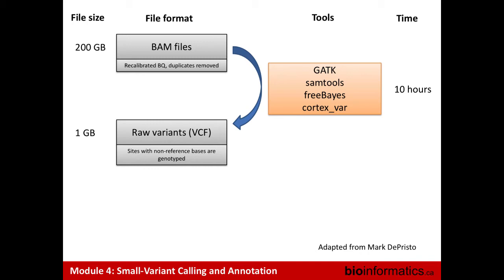Mostly we'll use GATK, which is one of the most performant callers, called HaplotypeCaller. But other callers exist, like SAMtools, FreeBayes, Cortex. And one of my main messages here: I'm talking about traditional DNA-seq. If you are doing cancer, forget about that. It's a completely different type of variant caller, because in cancer there are many other parameters to take into account, like purity, cellularity, clonality. So these callers are not dedicated to work with cancer. Here, it's really callers dedicated to traditional whole genome or whole exome variant calling.